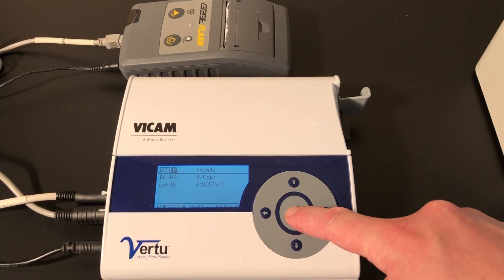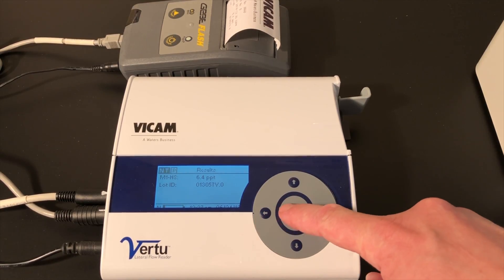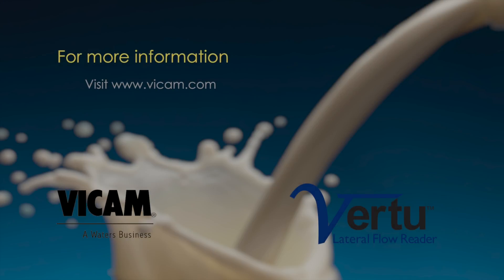Use the right arrow button to move the cursor to P. Press the center button to print the results. Use the left arrow button to move the cursor to NT for next test. Press the center button to prepare for your next test.